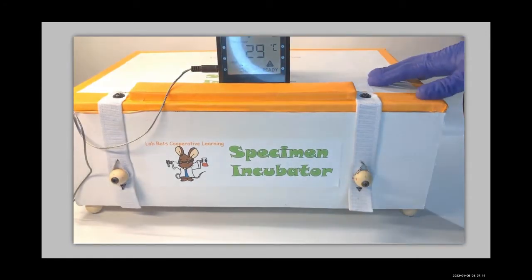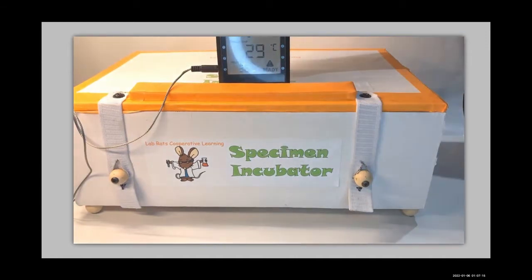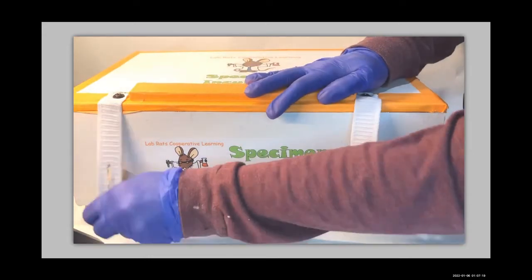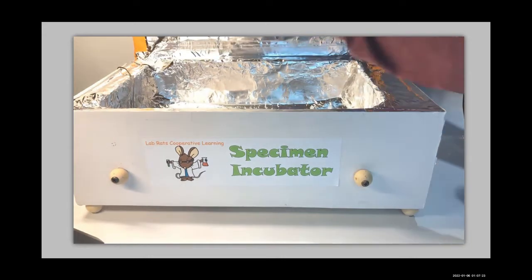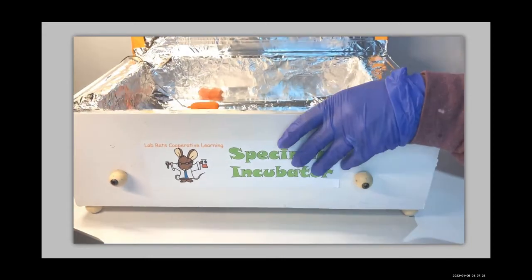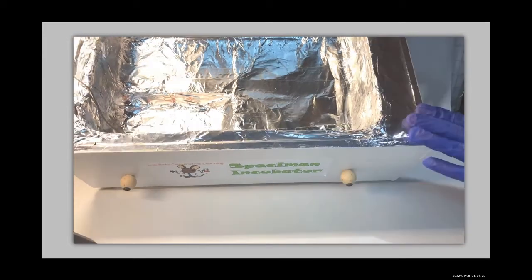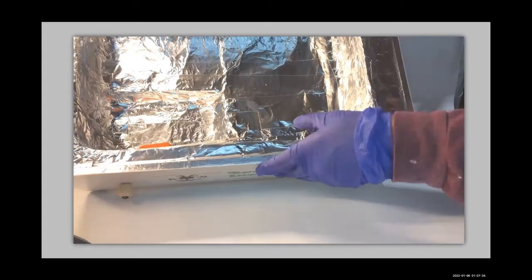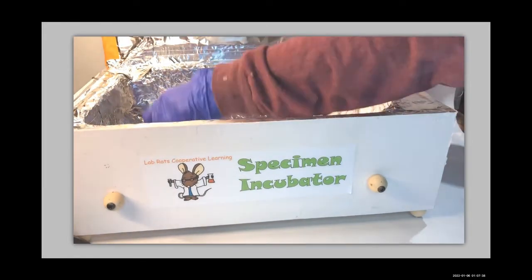Currently our temperature is 29 degrees Celsius, but it will warm up. And here's a look at the inside of our incubator. We have a temperature probe in there, and you can see that depression on the left. That's for incubating samples in taller bottles, like flasks. We'll be putting our agar plates right on the higher elevation.